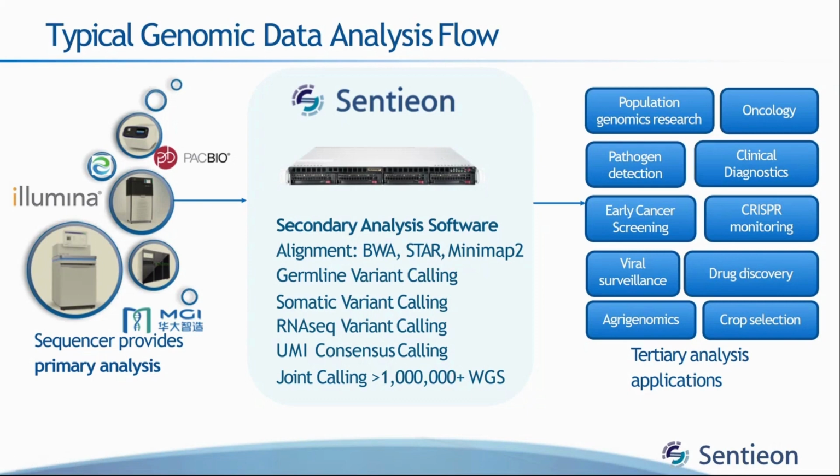We know that this secondary analysis part is a time-consuming operation, and the data provided by the sequencer is also large and voluminous. So when the number of samples is small, limited, we can easily deploy these open source tools and perform our analysis. But what happens when we are dealing with huge cohorts, say 100 or thousands of samples at a time? So software like Sentieon at these times offers verified pipelines to handle the data and execute the secondary analysis rapidly, thus making it a very user-friendly interface.